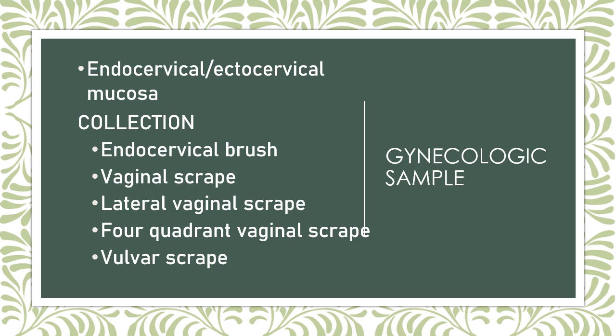Your vaginal scrape is used for patients with hysterectomy. Your lateral vaginal scrape is for hormonal evaluation, vaginal hormonal cytology, which we mentioned earlier. Your four quadrant vaginal scrape is for the localization of your vaginal adenosis. And your vulvar scrape is for the detection of your herpetic lesions or cancers.